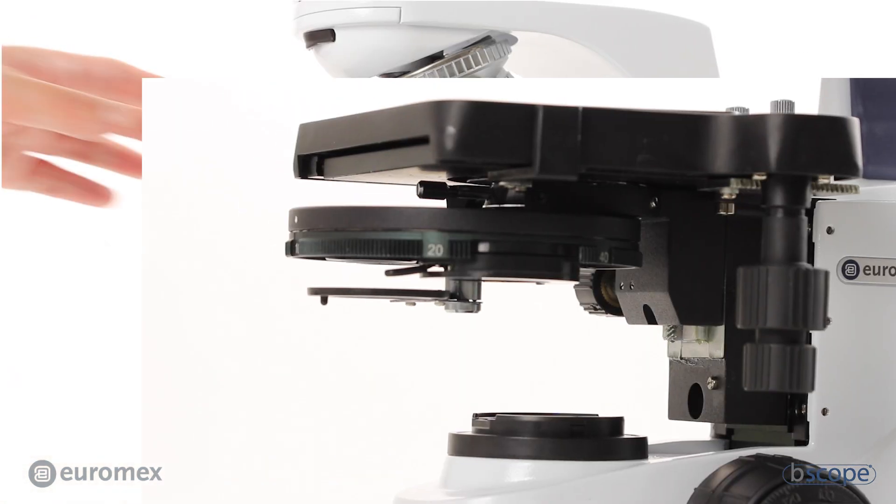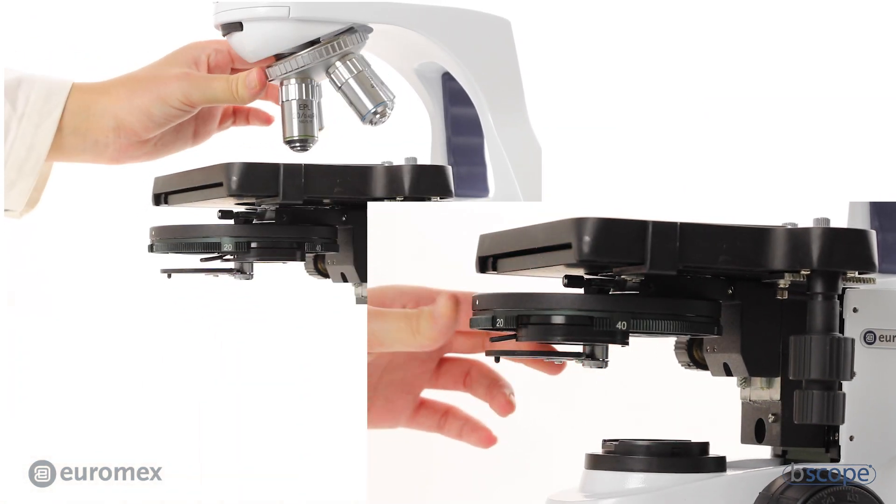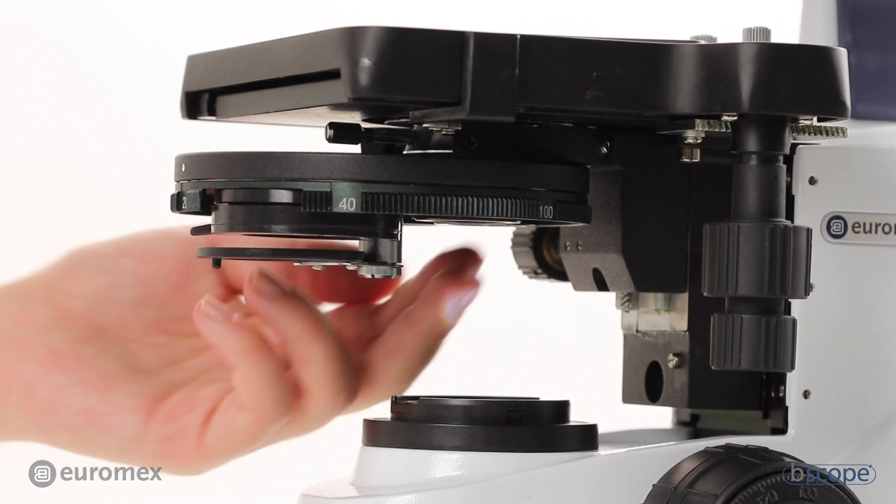To continue, choose the 20 times objective and 20 on the selector and center the annulus for the 20 times objective.